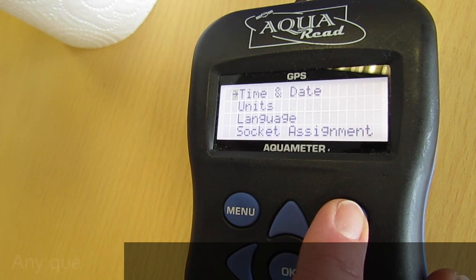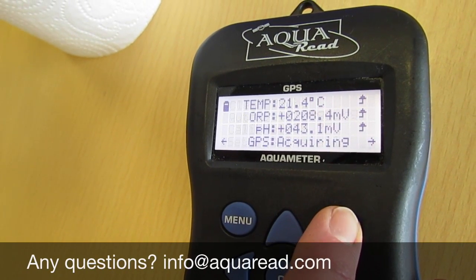Press okay to confirm the configuration.